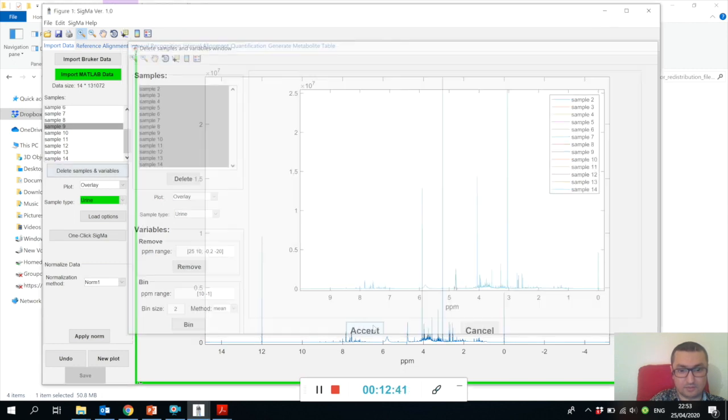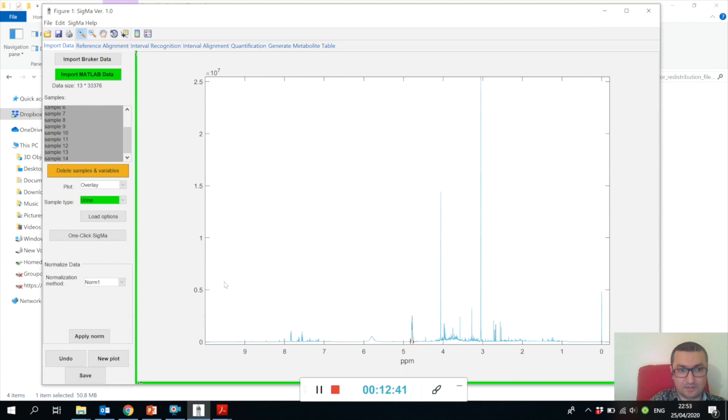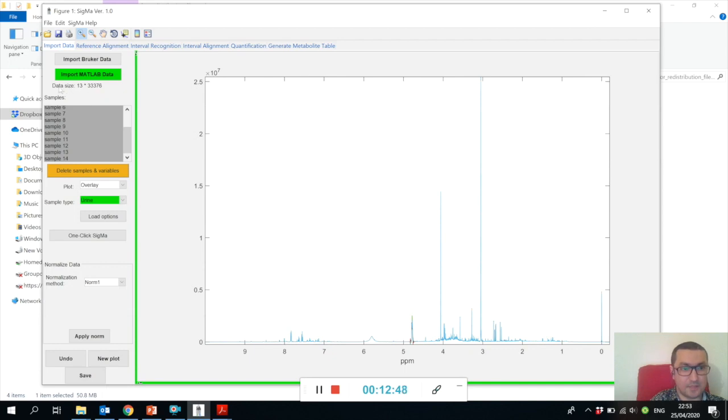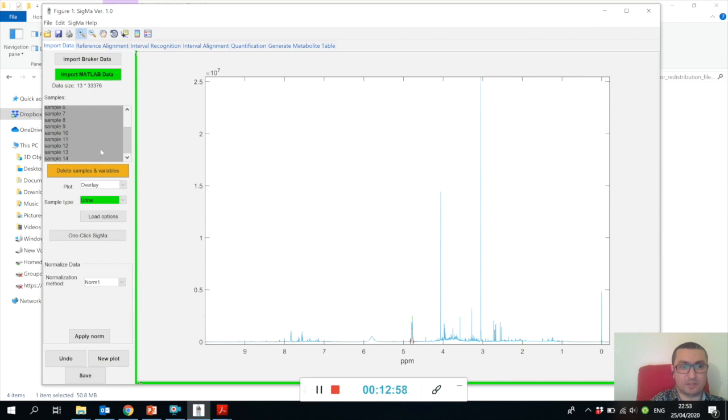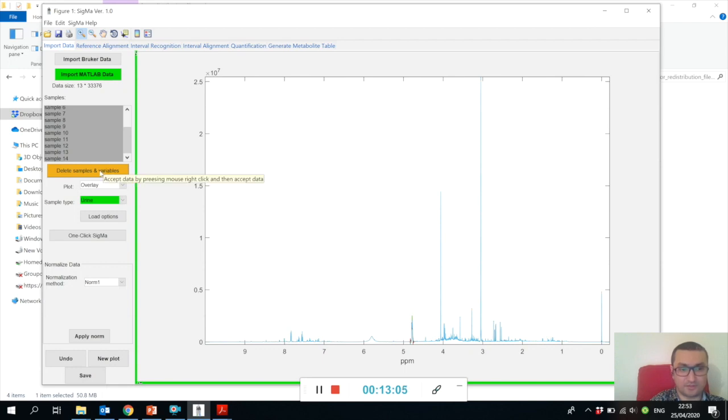We can say binning method - let's say it's mean - and let's bin with a bin size of two, which will reduce the spectral length by two. We say Bin, and Accept. You can see after Accept your sample size has changed - your data size has changed.